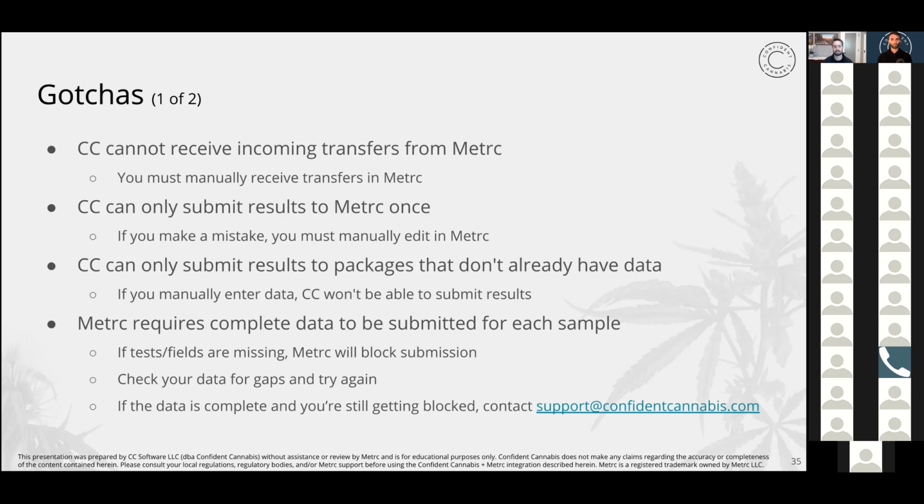So if you manually enter data into Metrc, we don't know about that. We'll let you try to submit results again, but then Metrc will throw an error and say, nope, you can't overwrite the results Confident. They've already entered data. So that means that you have to go make whatever other submission you need manually in Metrc.